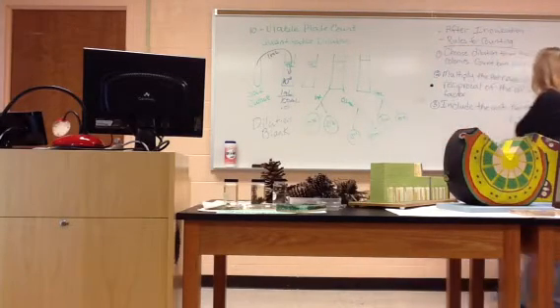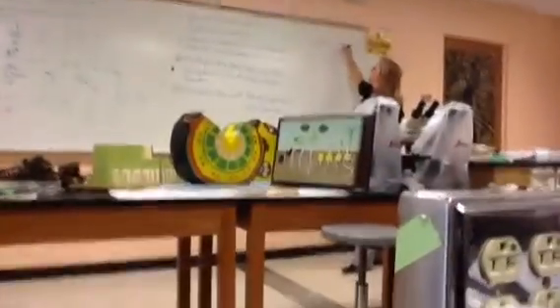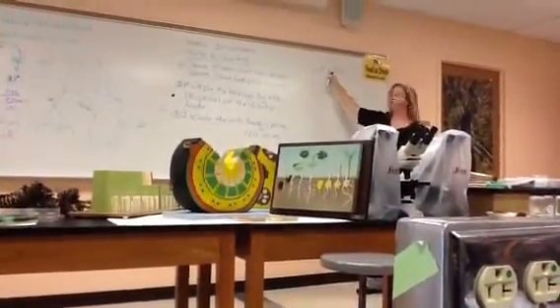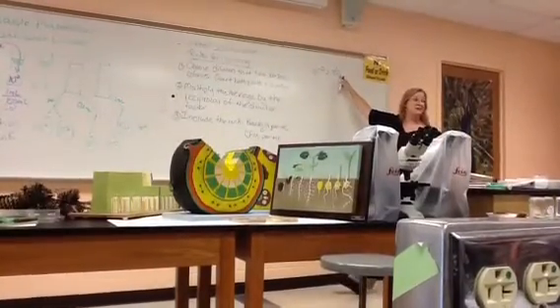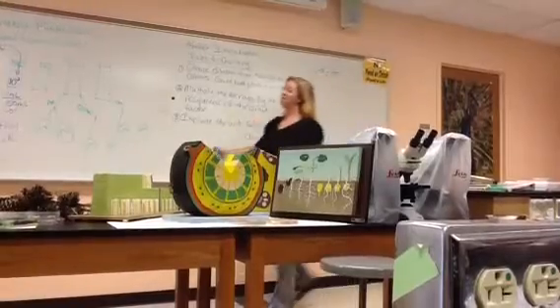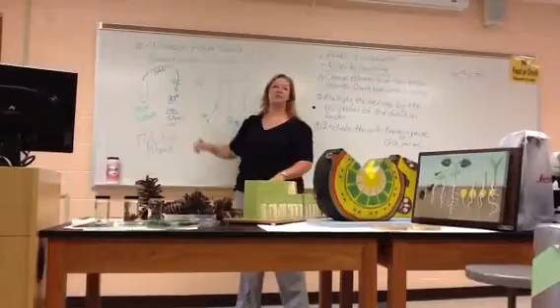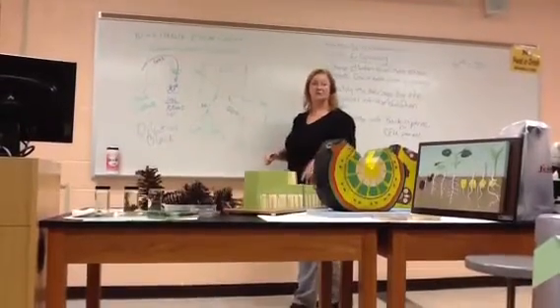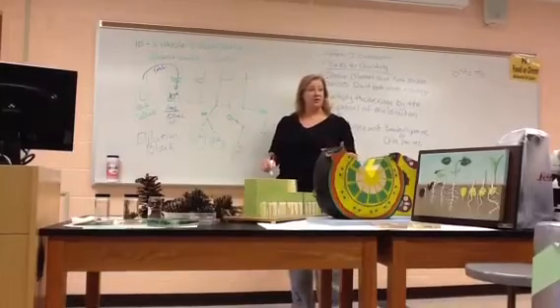10 to the minus 2 means 1 over 100. That 2 tells us that there are 2 zeros in the denominator. That's all it means. And we just made 1 ml of bacteria and 100 mls of total volume, so that minus 2 means 2 zeros on the bottom, 1 with 2 zeros. You'd mix it up, right, to distribute those bacteria.